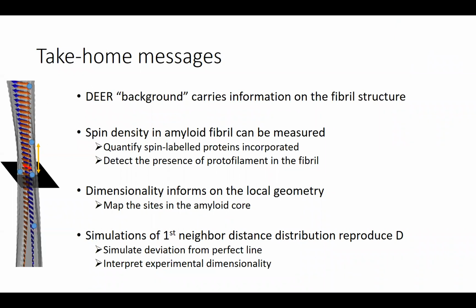Yeah, I always record it anyway, and I use it as a way to reassure that what we're doing is consistent. If you look at T2, for instance, you see that the T2 relaxation correlates with the alpha that we measure and that we interpreted as being a spin density.